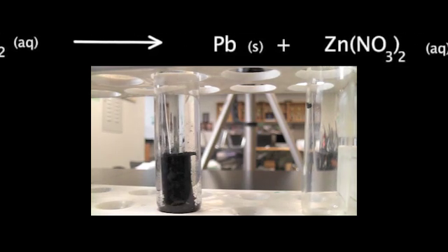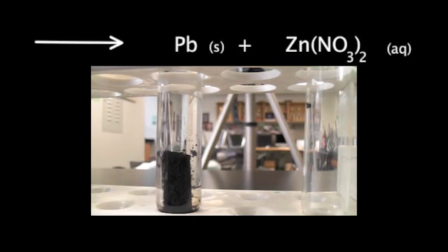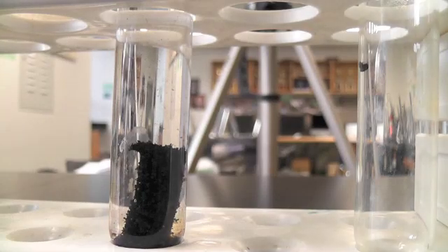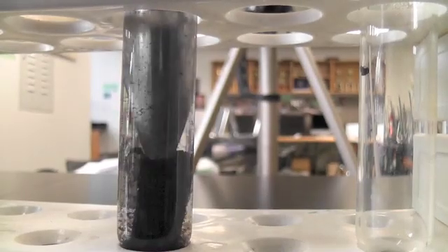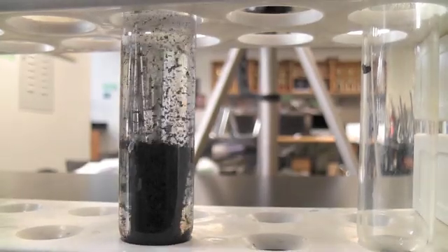Some people say, oh, it's growing or some fur grew on it — but no, that's the lead. You can see that it is quite dark. You can put a spatula or stirring rod in there and just poke it around a little bit. All those dark specks are pieces of lead.